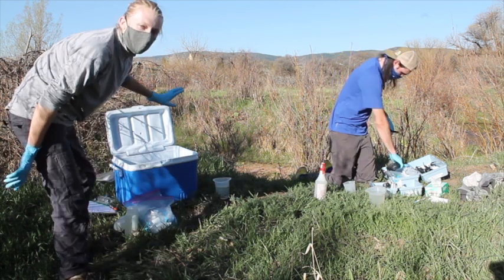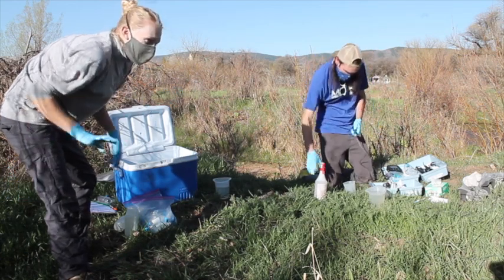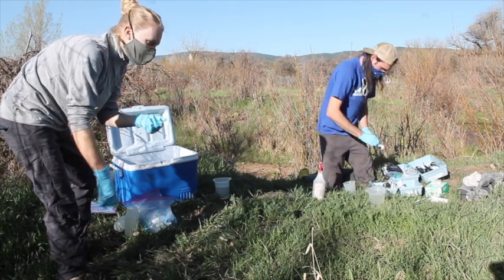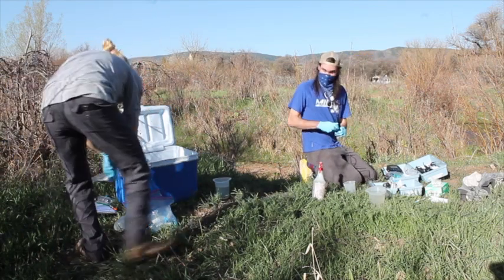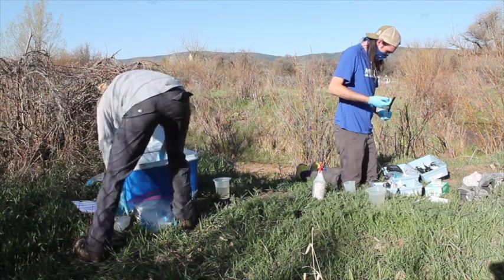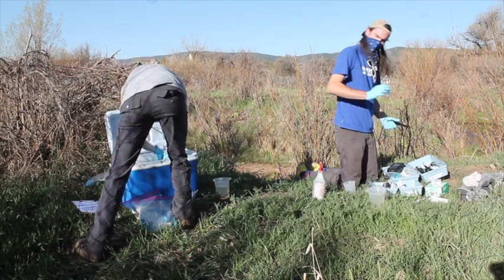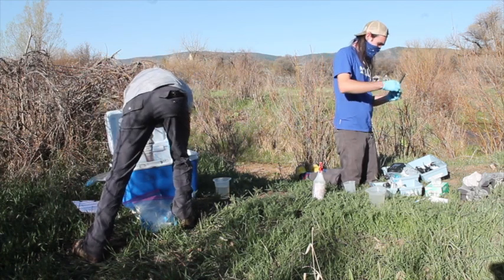Now we're going to put all our samples in the cooler to stay cold. Ideally you'd put all of them in there, but if you want to prioritize, you should do coliforms, anions, and DOC. And what I'm doing now is calibrating the conductivity meter.